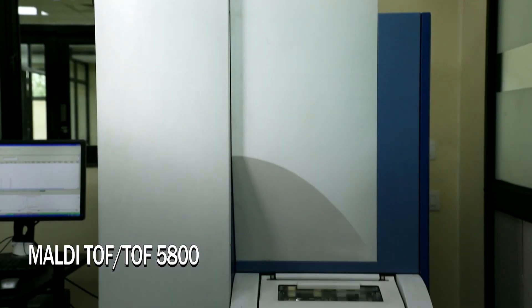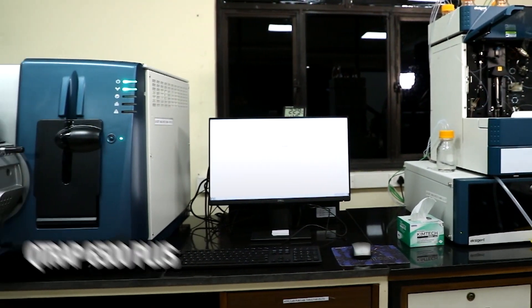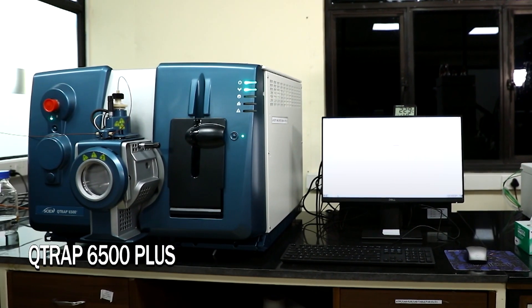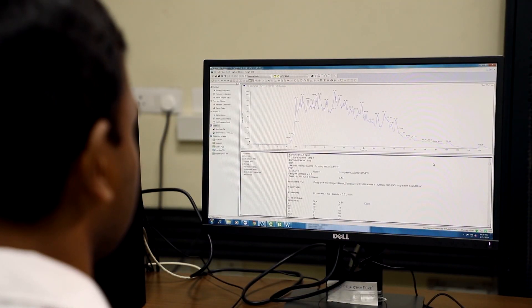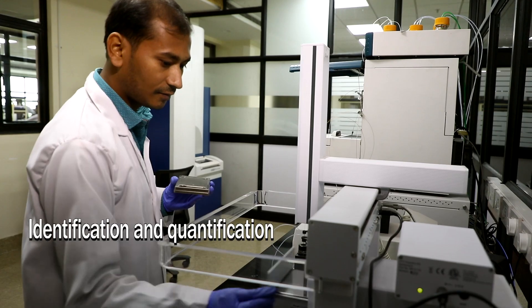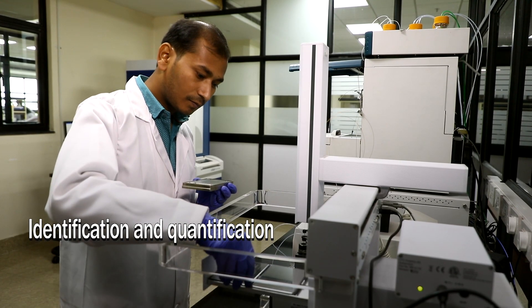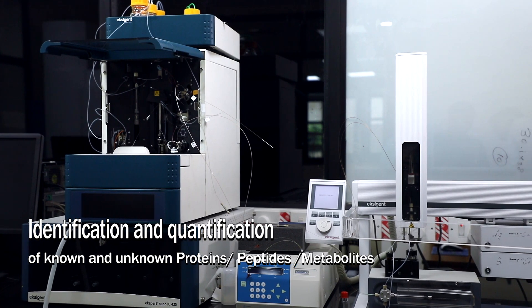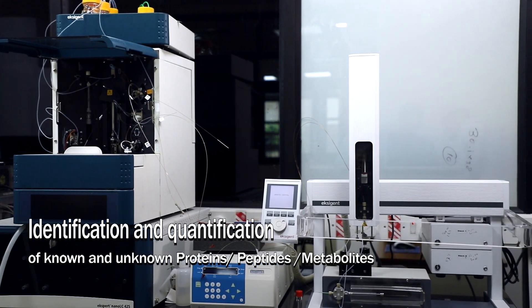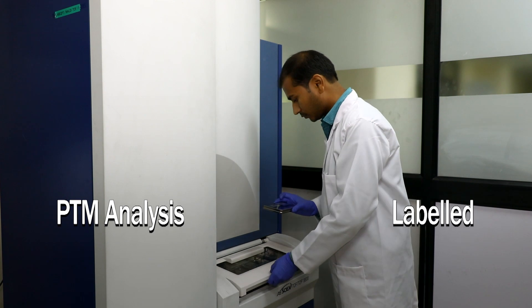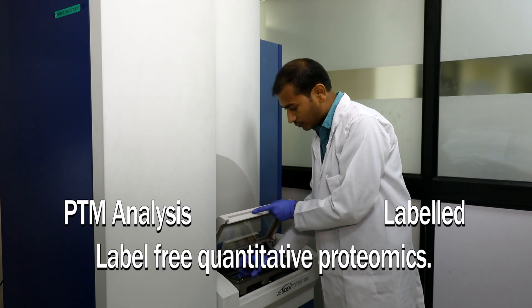This facility provides training and services for identification and quantification of known and unknown proteins, peptides, metabolites, PTM analysis, labelled and label-free quantitative proteomics.